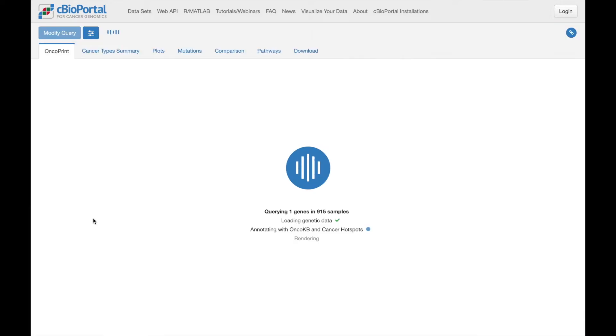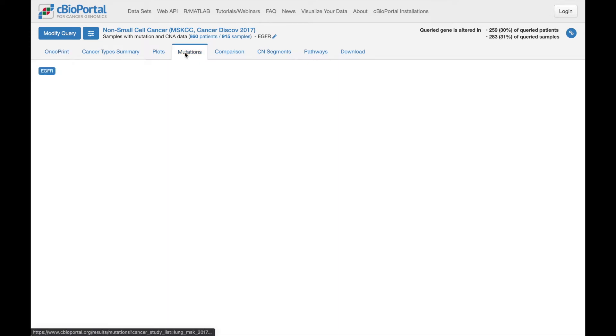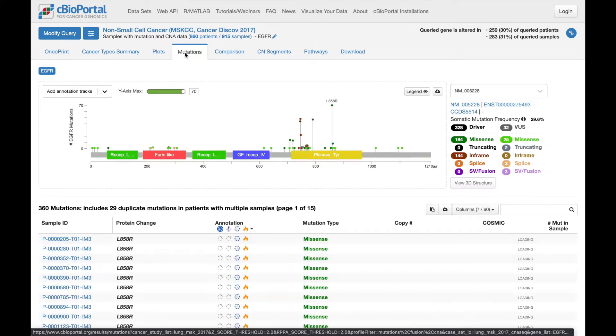Submitting the query brings us to Oncoprint, where we can see that 30% of patients have an alteration, primarily mutations. So let's click over to the mutations tab and look at those mutations in greater detail.